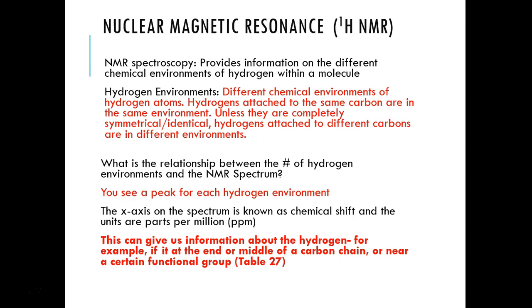Okay, so the relationship between the number of hydrogen environments in the NMR spectrum is that we will see a peak for each hydrogen environment.